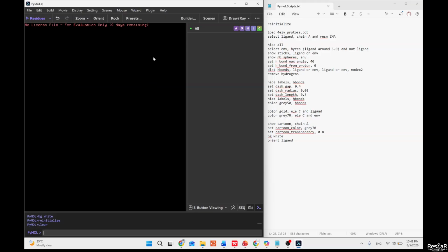Now, our goal in this tutorial is visualization, high quality images in Pymol. For that, I prefer using a script, because Pymol is designed so that I just write plain language scripting that is wrapped around Python and command line interfaces. As you can see here on my right, I have a lot of script, and this is exactly what we're going to try to implement. Usually, you write the scripts carefully, and once you are done, you can run it at once and see everything that happened to your structure. That's exactly what I recommend in Pymol.